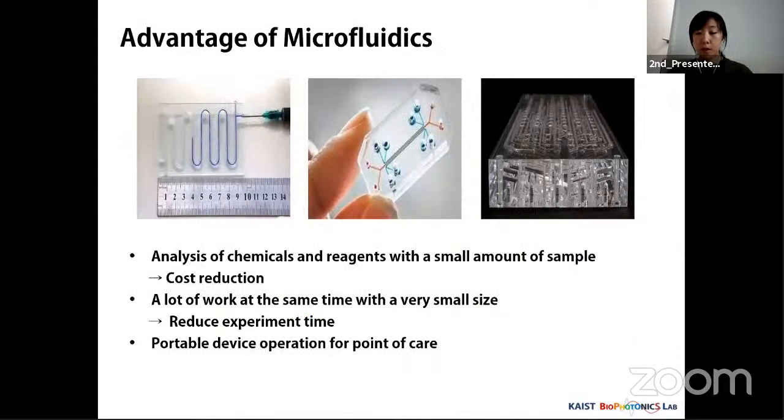There are several advantages of microfluidics. Among them, I can think of a few representative ones. The first is cost reduction. This means that it can be analyzed with a small amount of sample and chemical. Second is saving time because many experiments can be performed inside a small chip. Finally, it is possible to make miniaturized equipment capable of point of diagnosis using this.